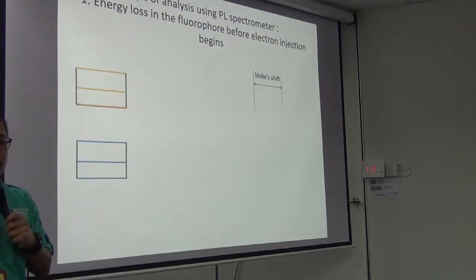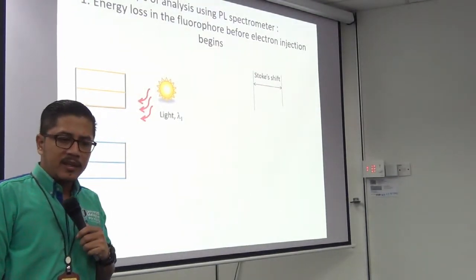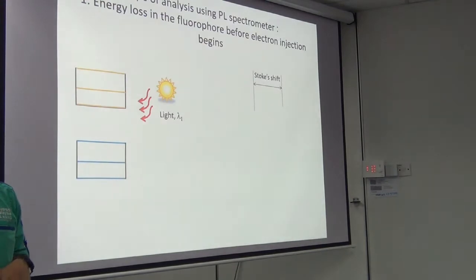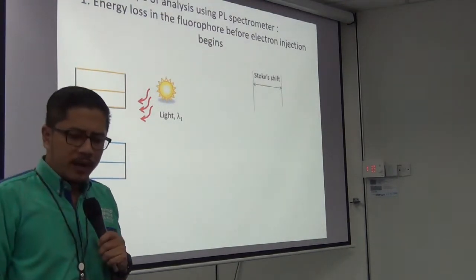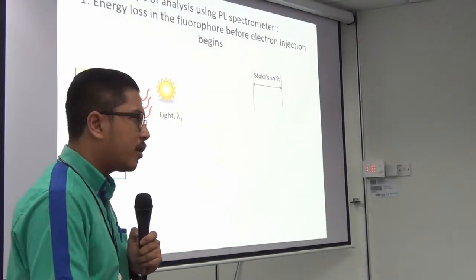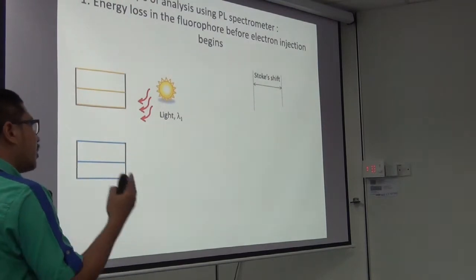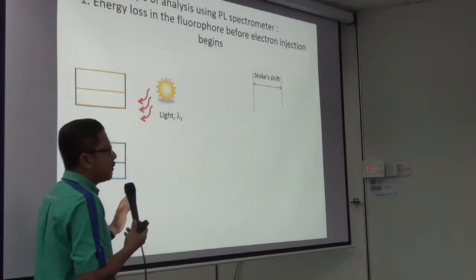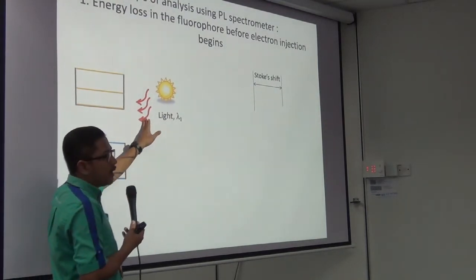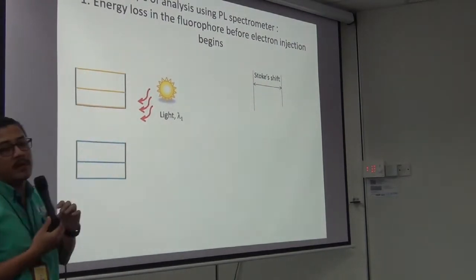So whenever we give light source with specific wavelength, how much energy do we need to excite an electron? It depends on our analysis using UV-Vis. So from the UV-Vis, based on the first excitonic peak, we could set the lambda that we want to use for the excitation of our sample.